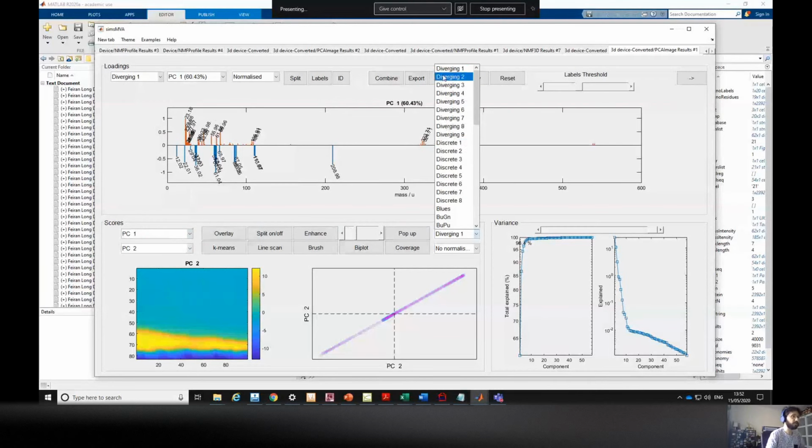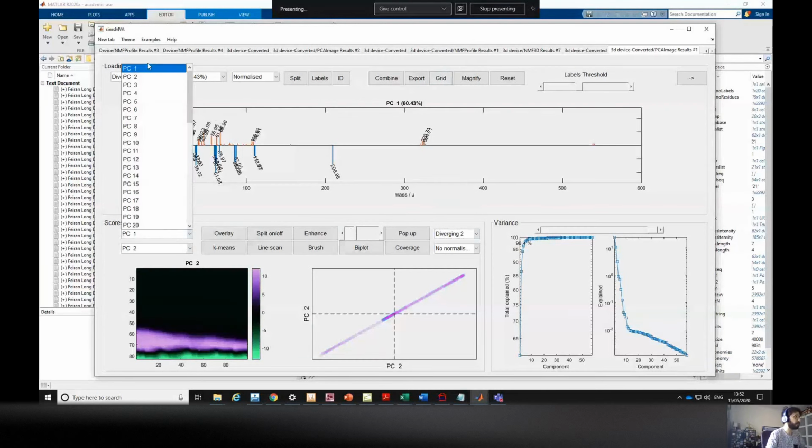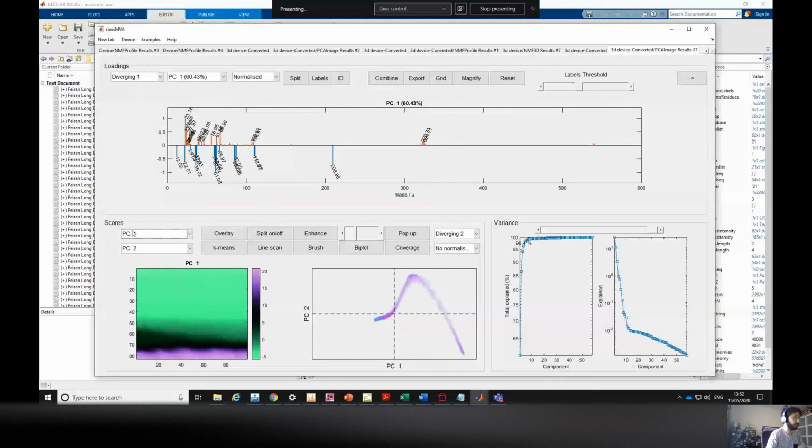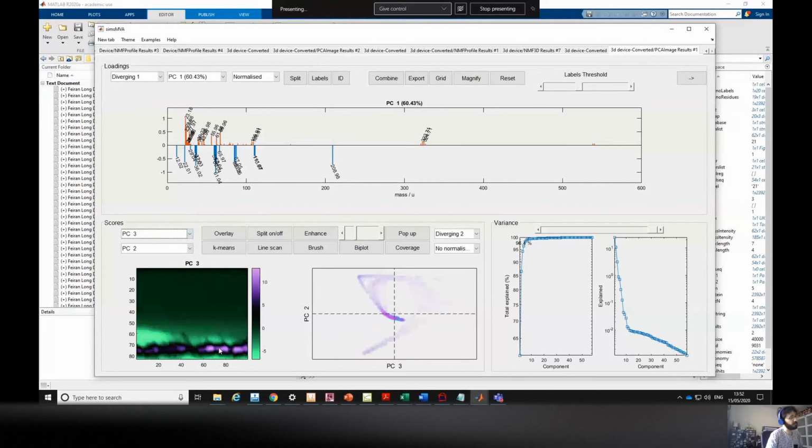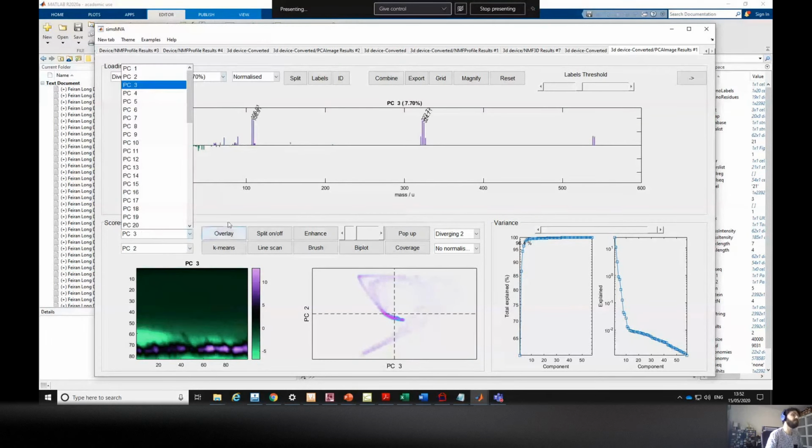And you can see how useful this can be, because now you can do PCA of this cross section. It's essentially a cross section, isn't it? And then you get your principal components of this cross section. So here, yeah, showing the layers and so on. Like we discussed last week, you can explore the chemistry looking at the Z view.